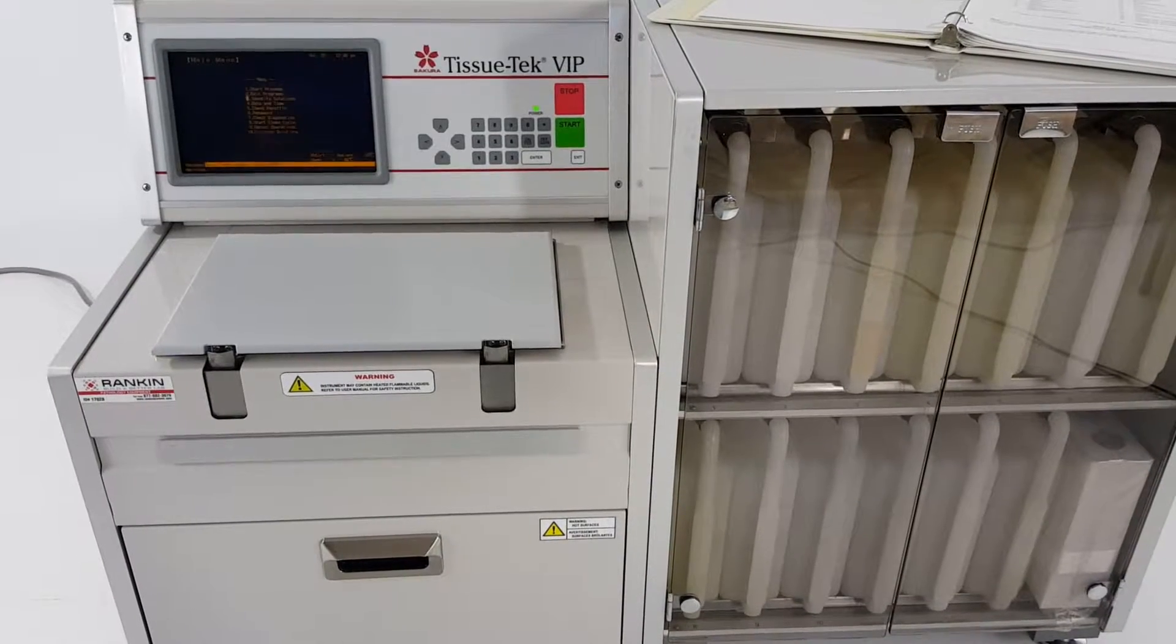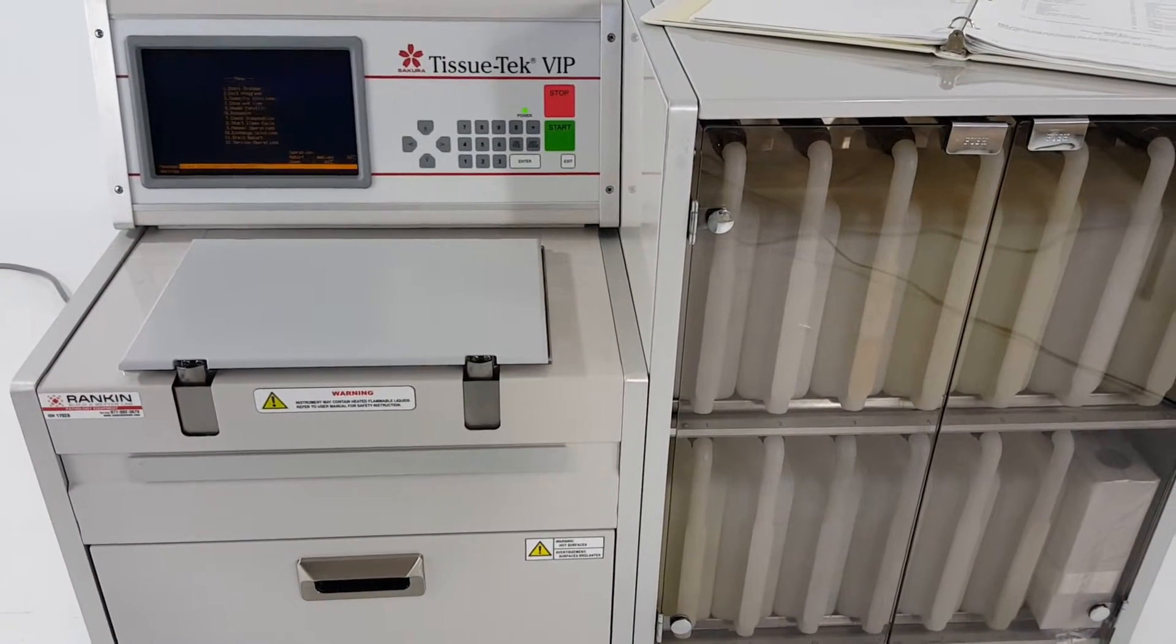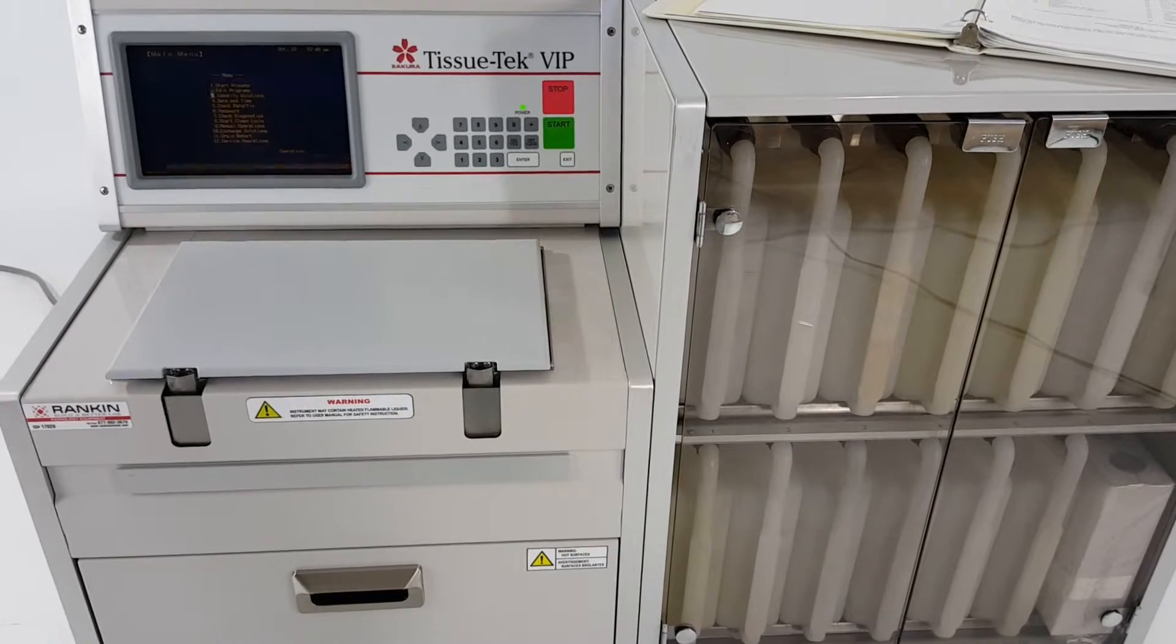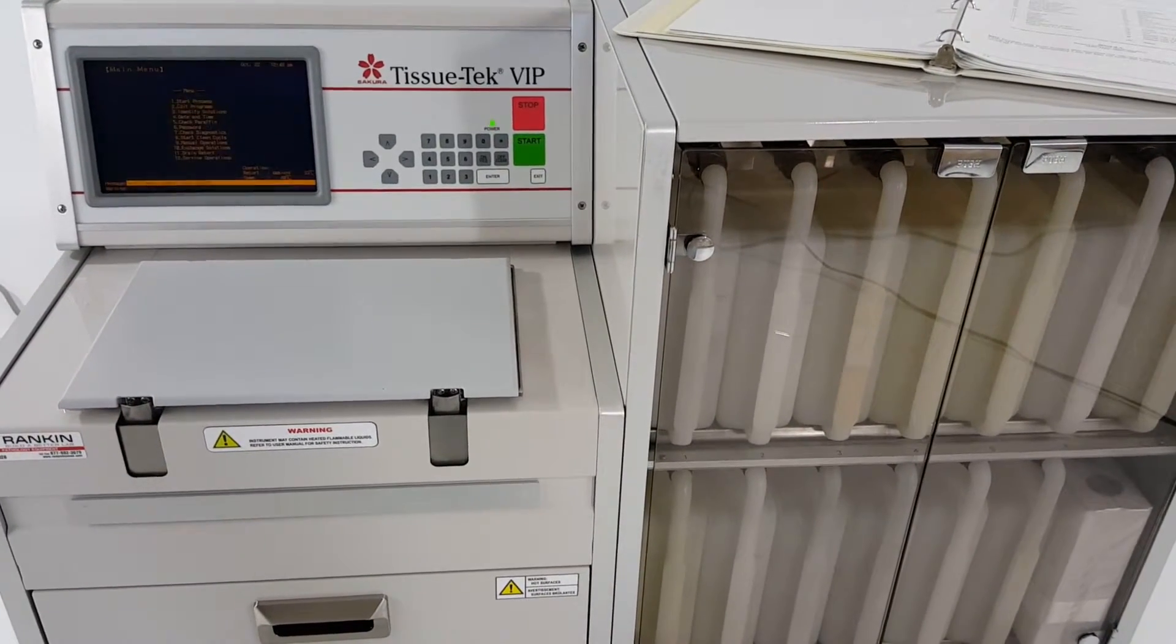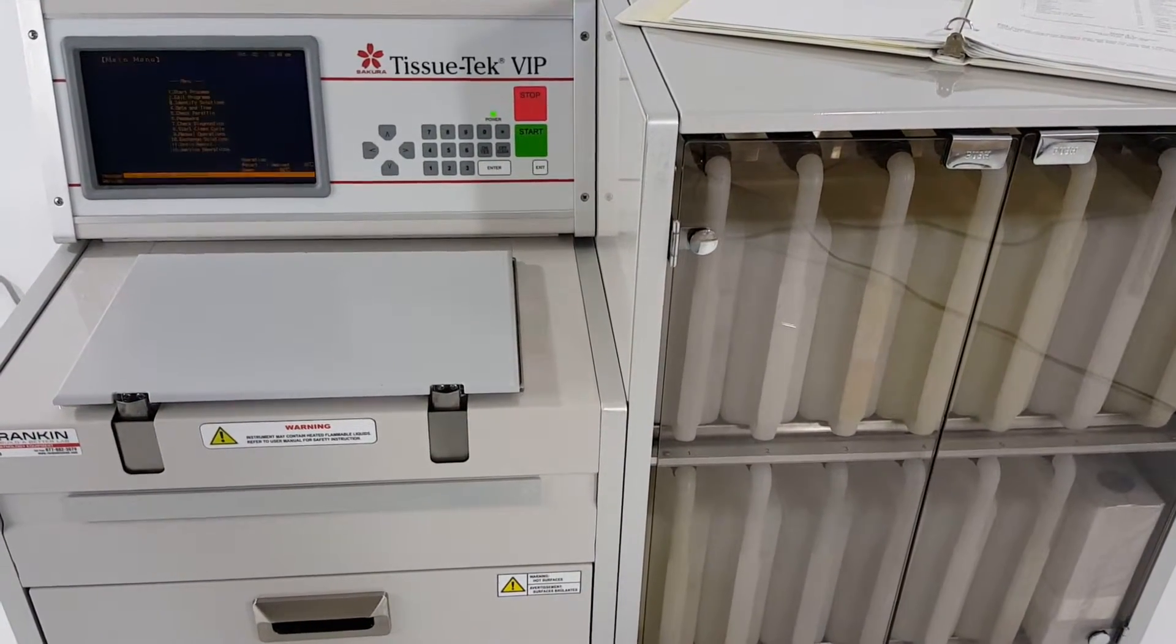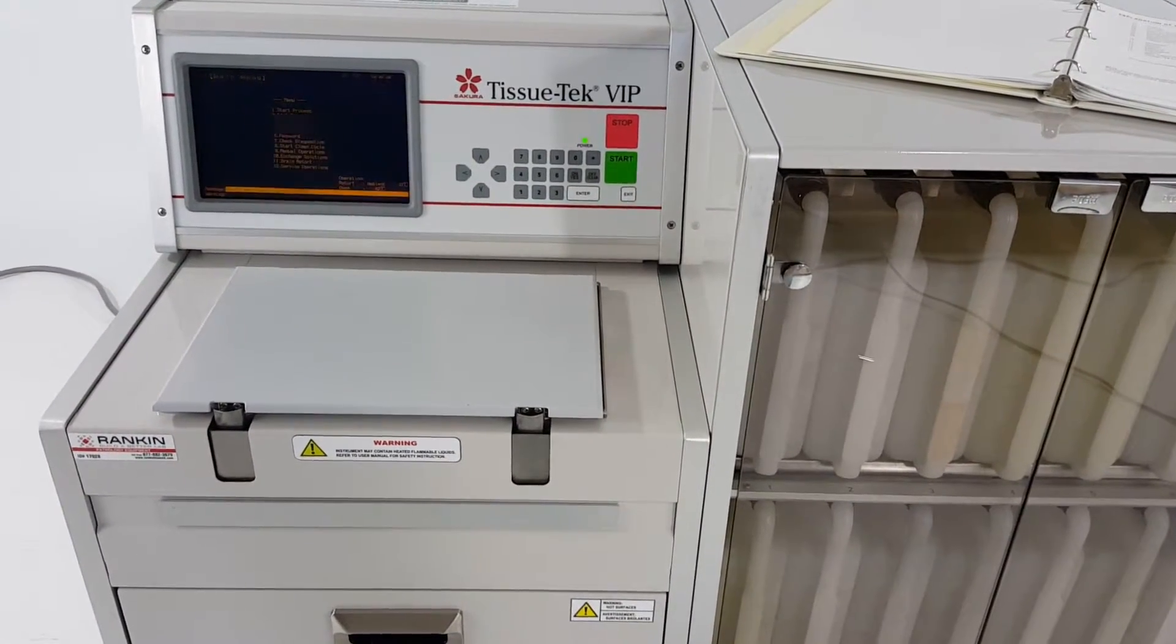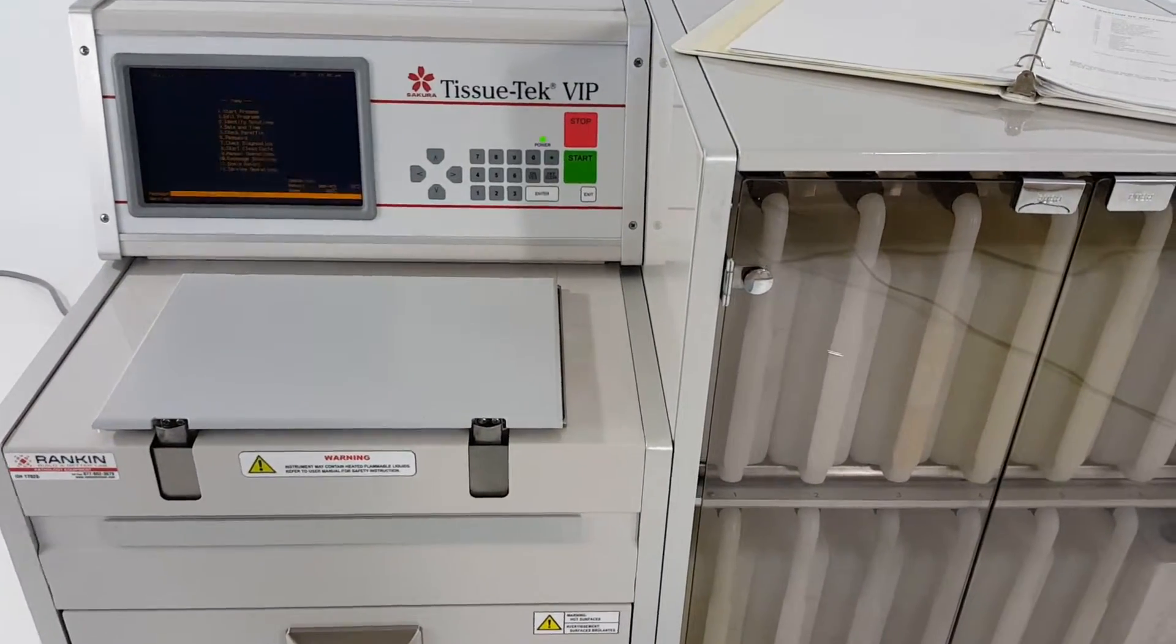This is a Sakura E300 tissue processor and I'm going to quickly show you how to program your reagents and also program a run when you first get this.